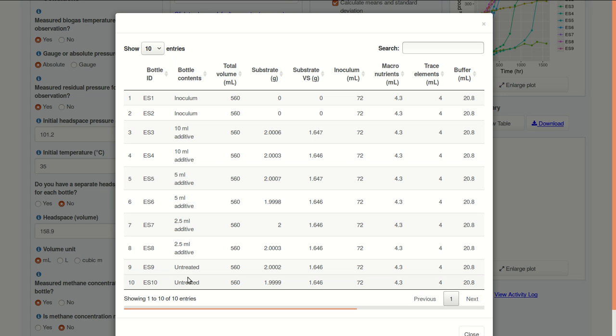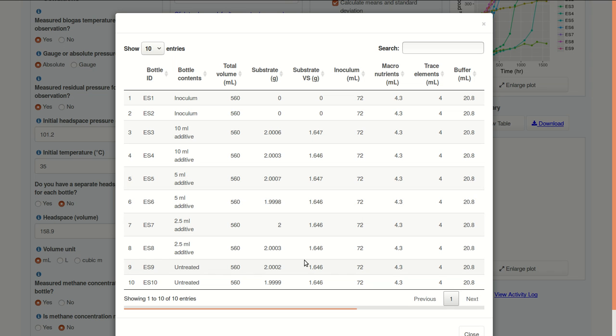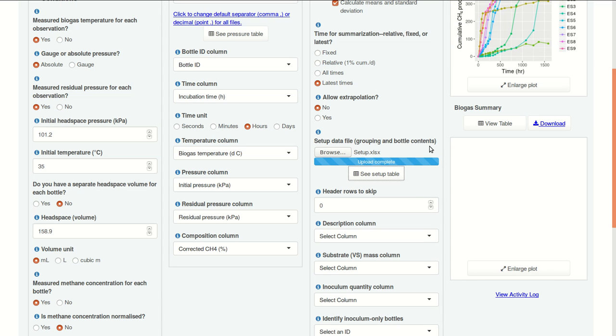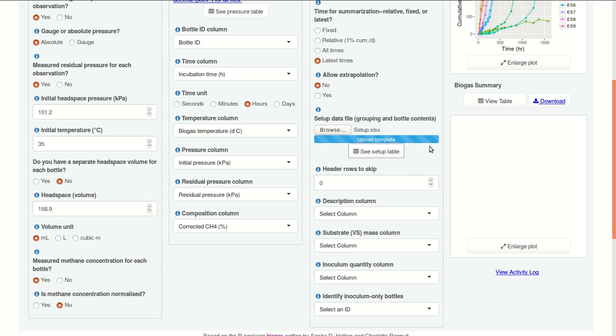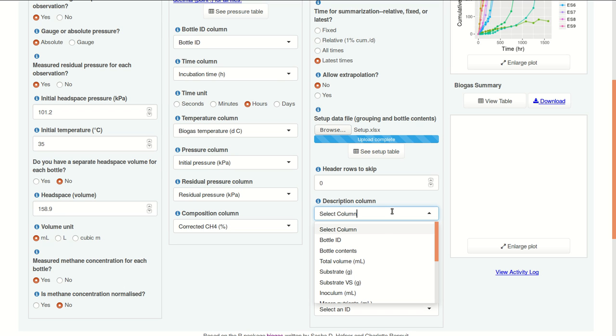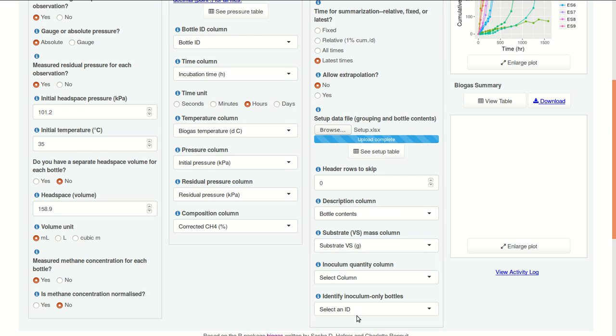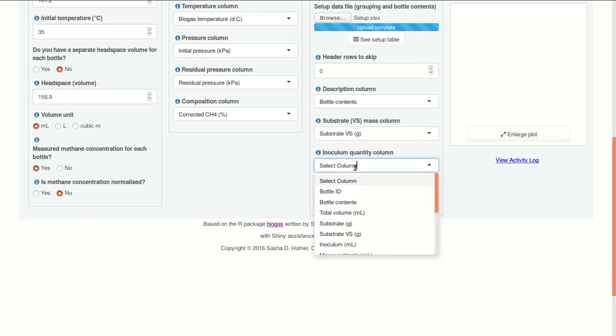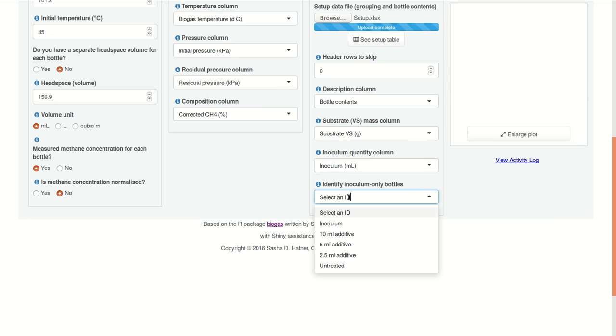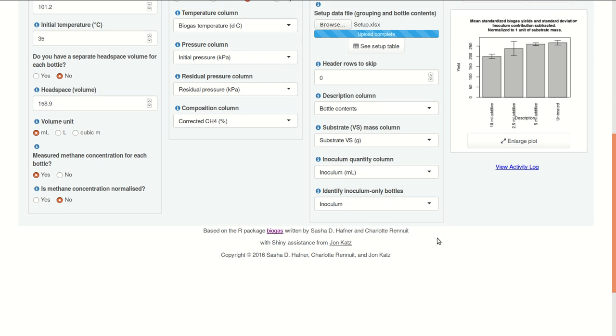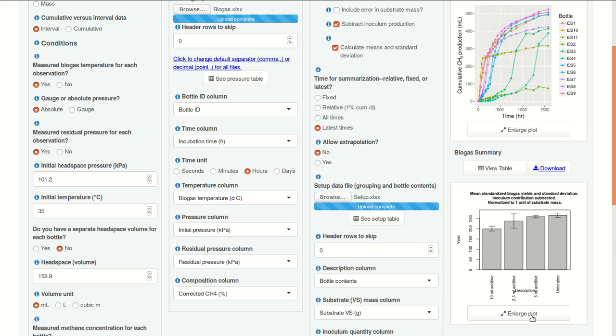And to give you a bit more information on these data, this was an experiment on pretreatment, and we have three levels of some additive, 2.5 milliliters, 5 milliliters, and 10 milliliters, and then an untreated control, and of course our inoculum only bottles. So the columns we see here are the ones in the setup file. Okay, so we don't need to skip any header rows, we need a description column. Inoculum bottle contents, VS mass, substrate VS mass is called substrate VS, and then inoculum quantity is inoculum, and finally our inoculum only bottles are called inoculum. So here we have our results.